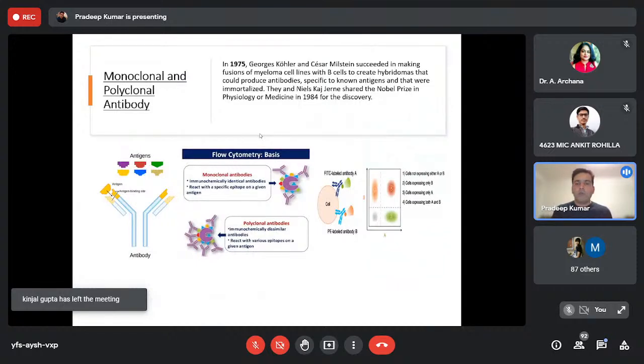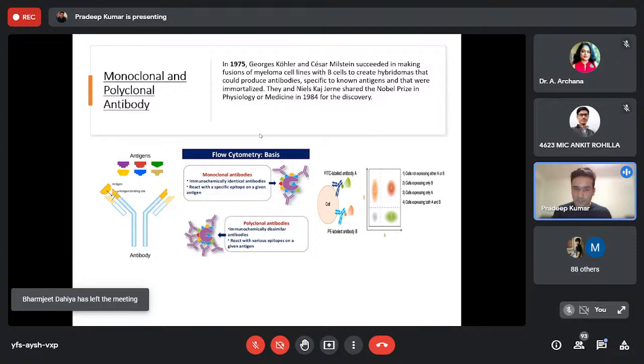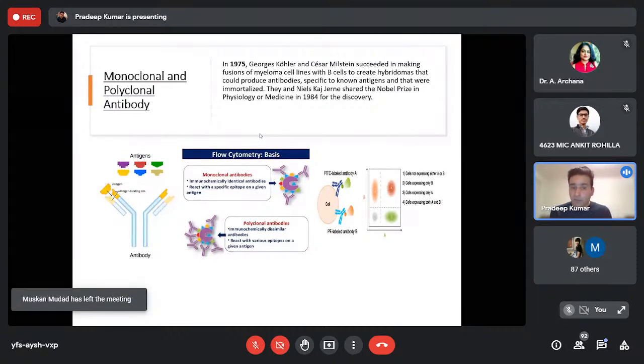So I'm going to cover a few terms that are really important to understand flow cytometry. One of them is what sort of things you need. Can you directly see everything on a flow cytometer by running cells? No, you just get a little information if you run your cells directly, just the information of size and the information of complexity. But if you are looking for fluorescence, then you need to provide it, because the fluorescence doesn't come from the cells, it comes from a fluorophore.